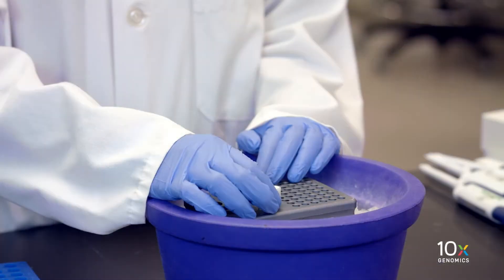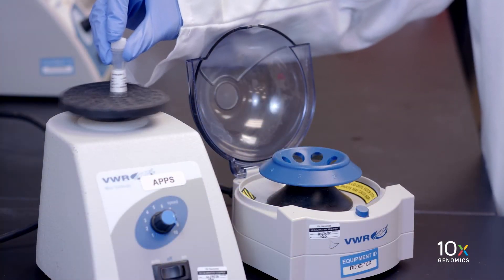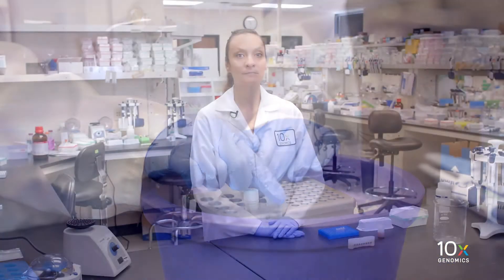We have completed the PostGem RT DynaBead cleanup step. Next, we'll perform the cDNA amplification reaction. We have amp mix, which we vortex, spin down briefly, and place on ice.